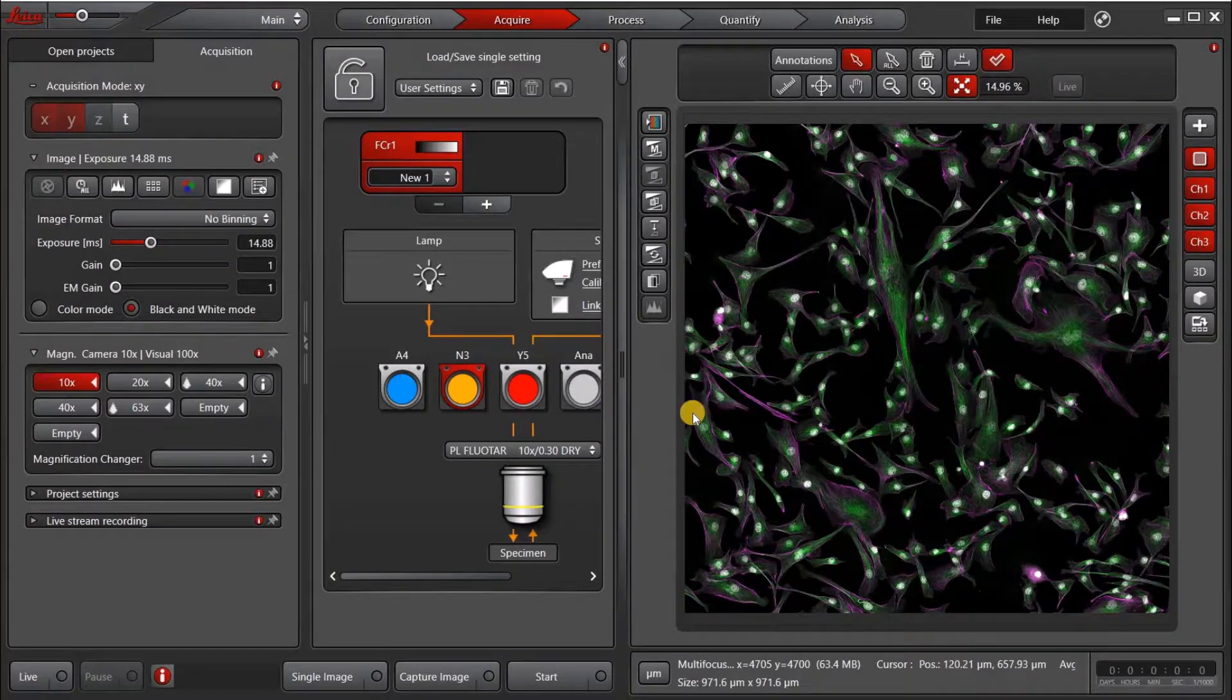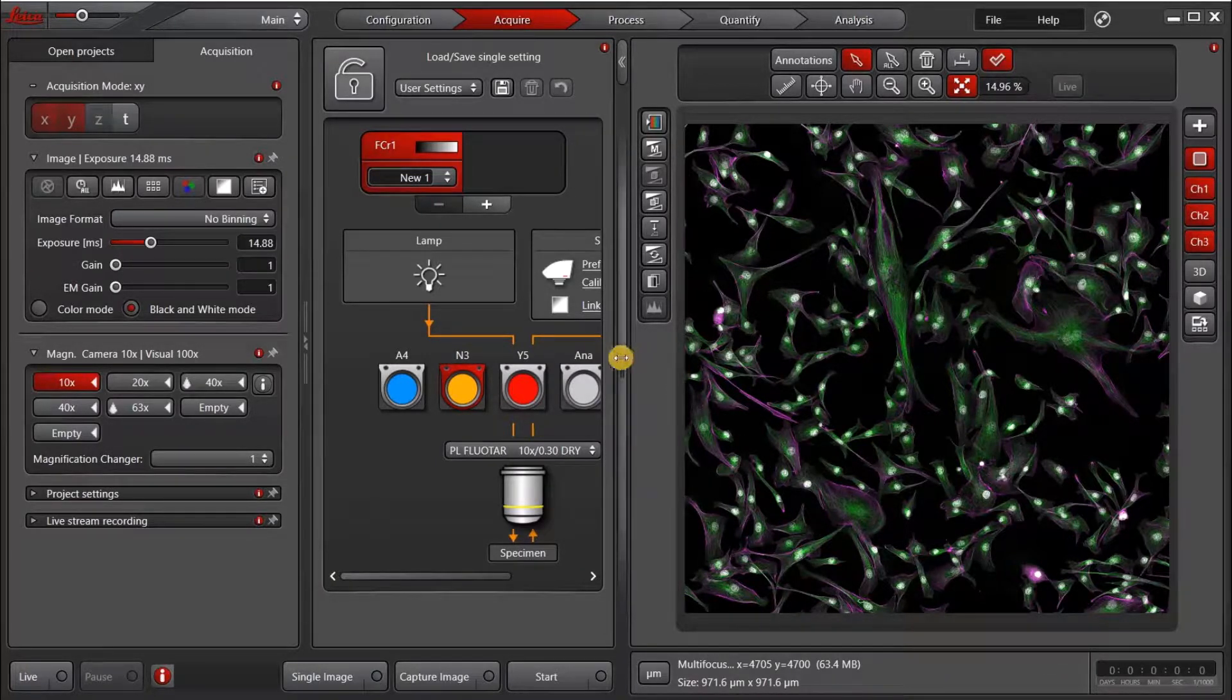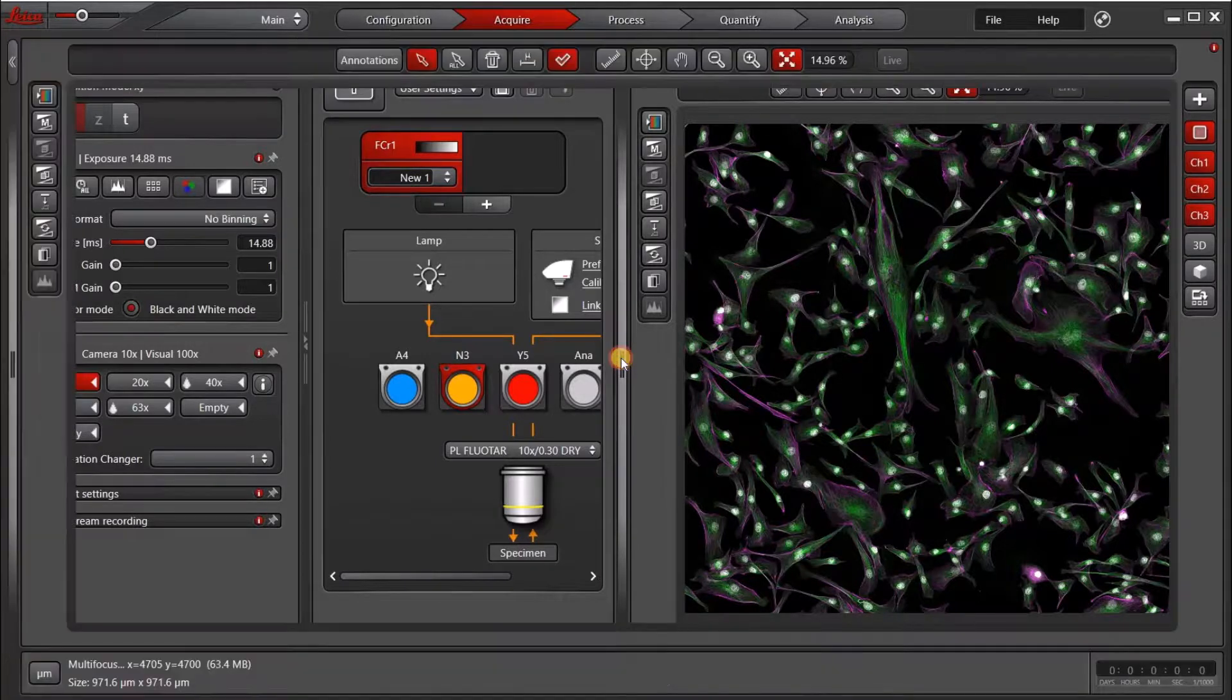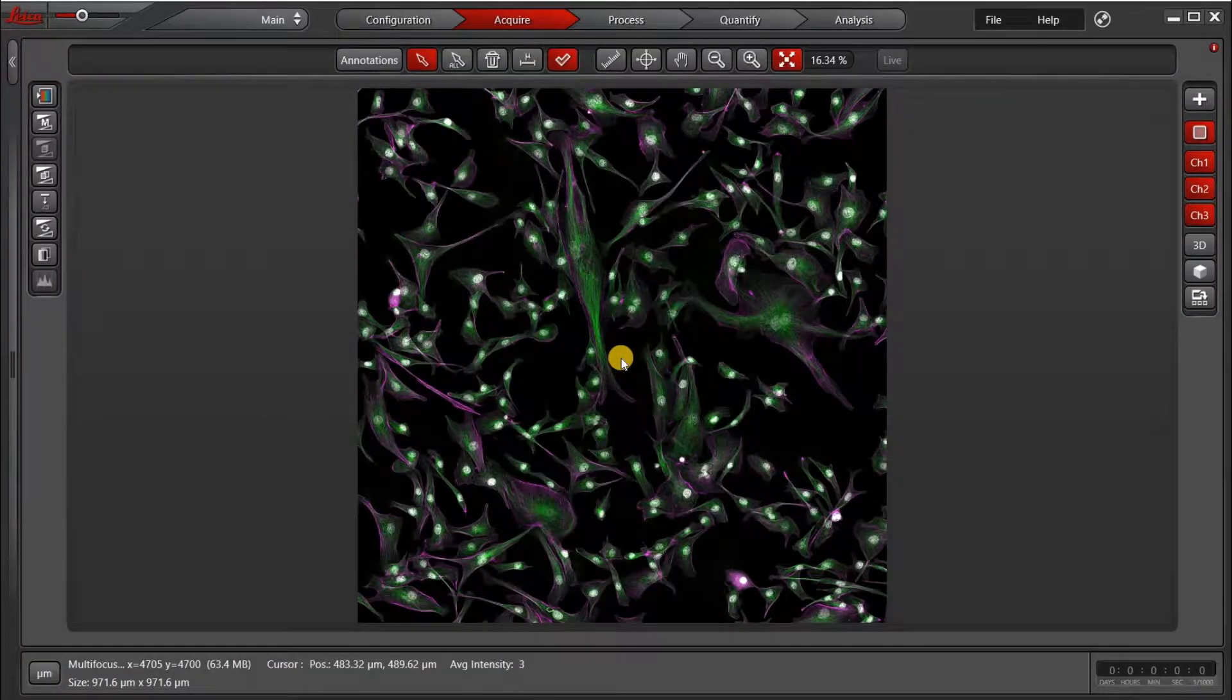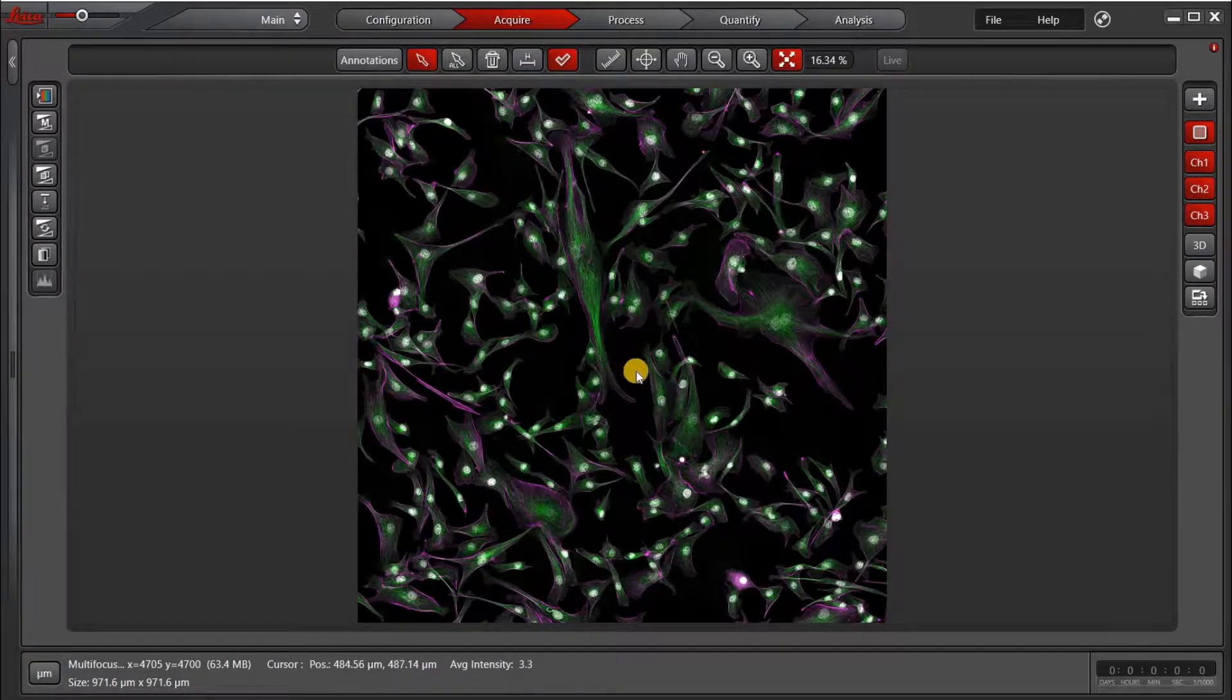So to make things a little bit easier to see, I'm going to double-click on this bar and make the image take up my whole screen.